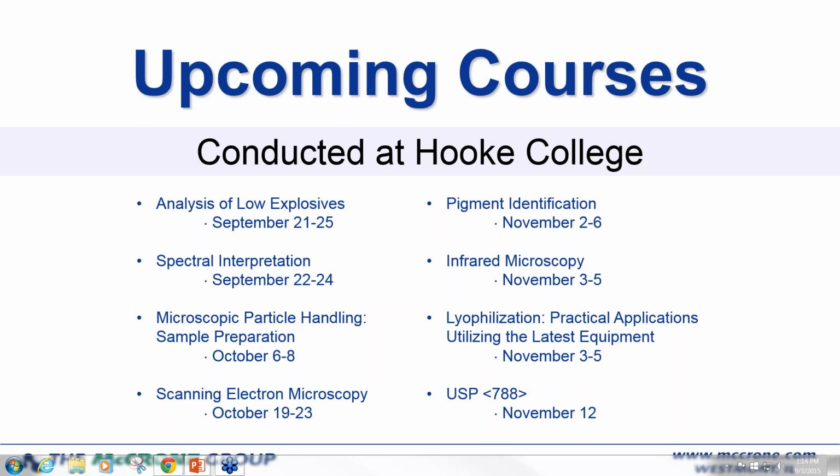And the other part of his question is, if not, do you recommend a database that is for sale? There are a lot of commercial libraries, and some of them are class-based. There are polymer libraries, there are inorganic libraries. I would recommend one that is in keeping with the sorts of samples you see the most. It's going to be the most useful.